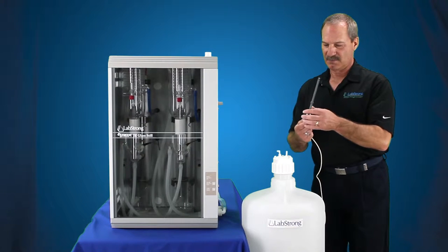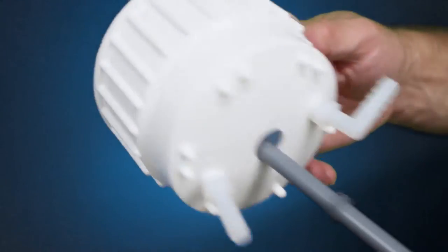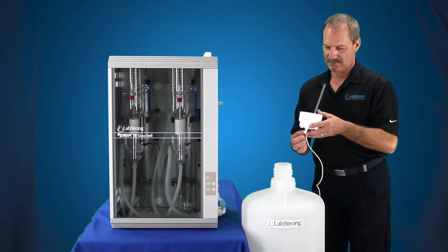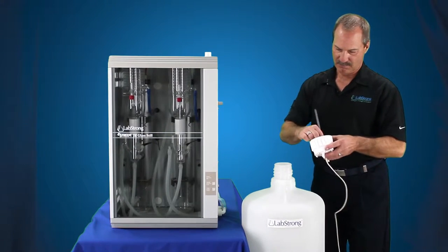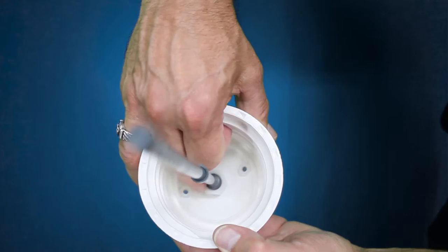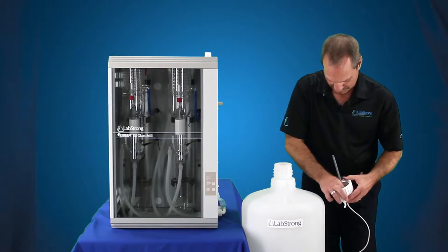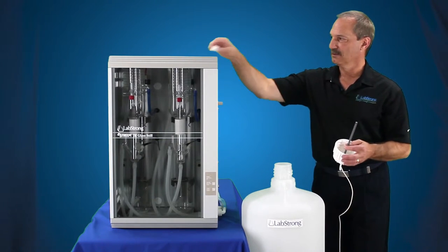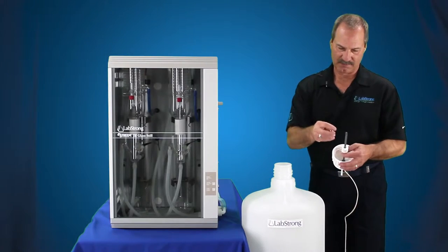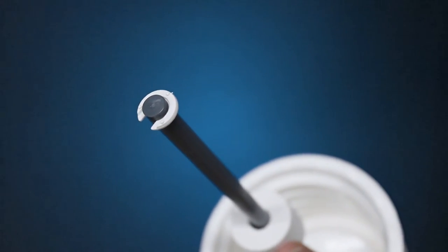There's also the bulkhead nut that gets removed and then the cap. You simply put the float switch down through the cap, tighten that down — hand tight should be good. There's an o-ring that goes in here as well to seal it. Tighten that down. Make sure you've got your lettering towards the top, and the clip just goes back on the bottom. And that's your float switch.